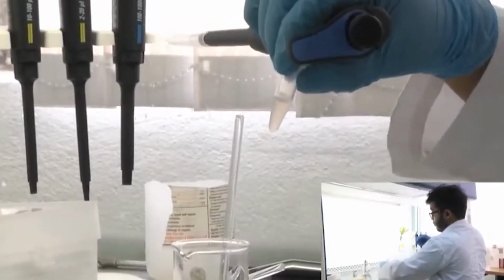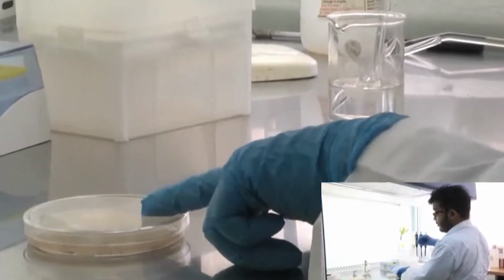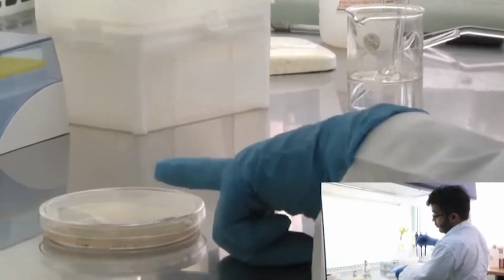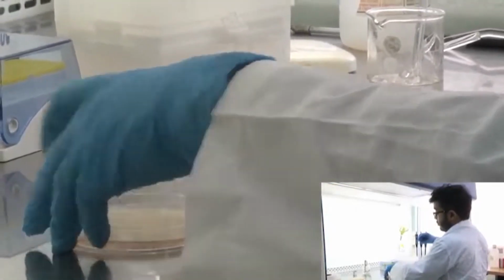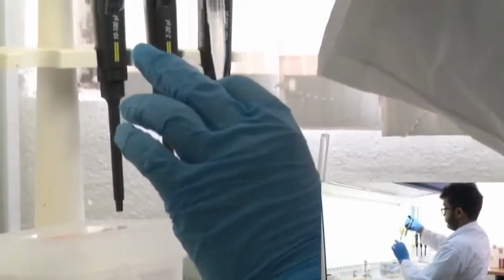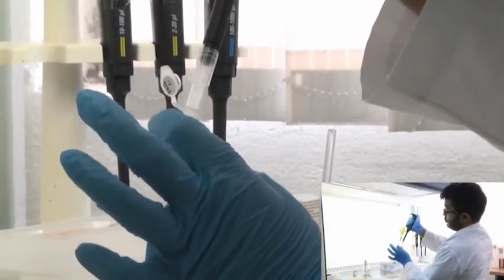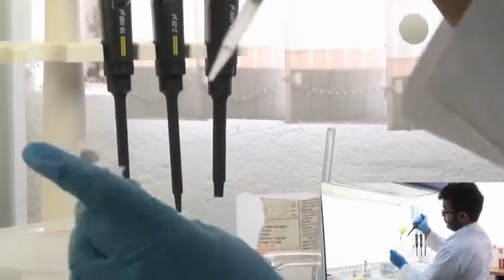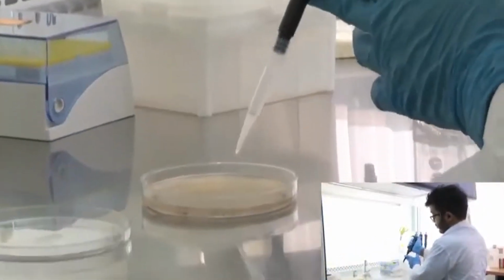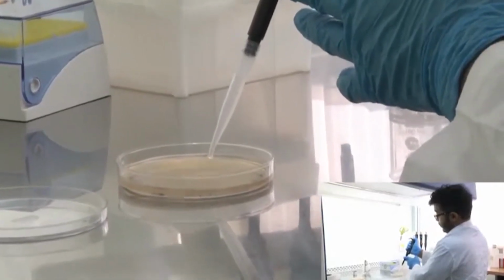Now when we spread the plate, we need to invert the plate again. So now it's kept in the normal position, where you take out the lid, mix thoroughly so that you take a sufficient amount of cells, and I'm going to add this to the center of the plate.